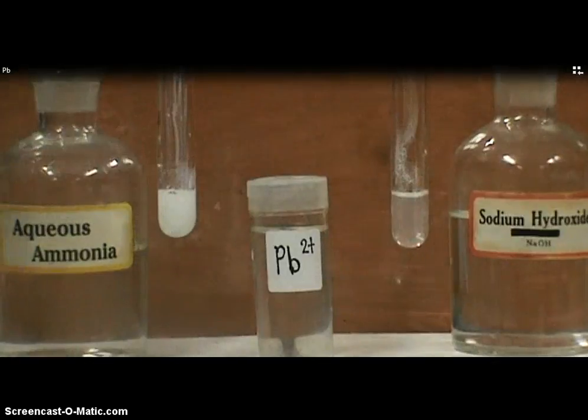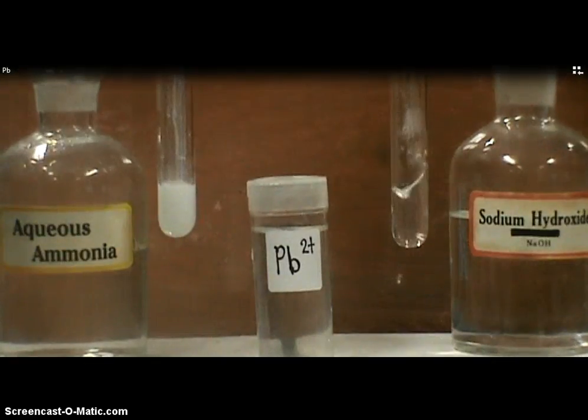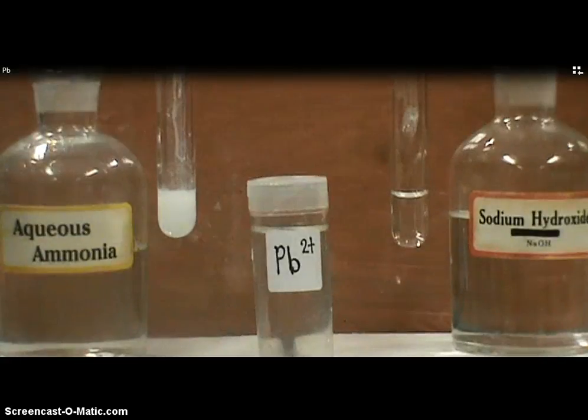When an excess of each alkaline is added, we notice that the white precipitate dissolves in an excess of sodium hydroxide, forming a colorless solution. But the white precipitate remains insoluble in an excess of aqueous ammonia.